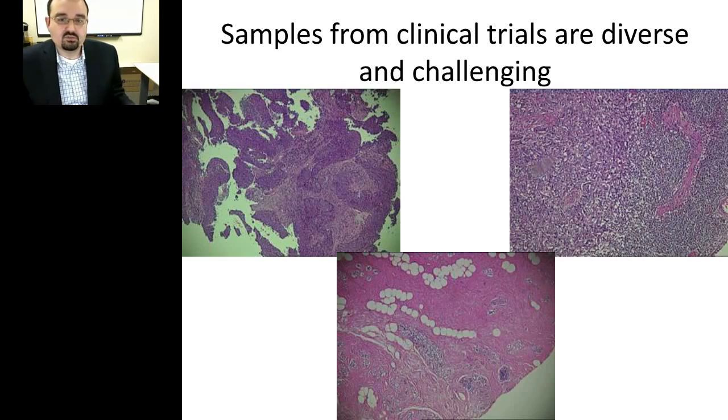We are going to be applying whole exome sequencing using the Ion Proton sequencer to discover germline and somatic mutations, RNA sequencing to profile dysregulated gene expression, and also profiling the plasma DNA to detect circulating tumor DNA as a biomarker of relapse.